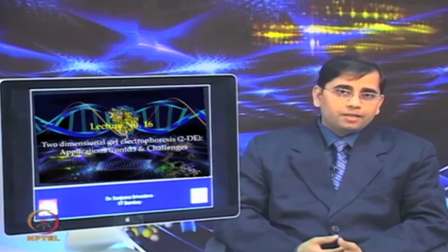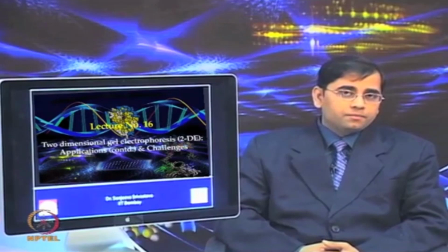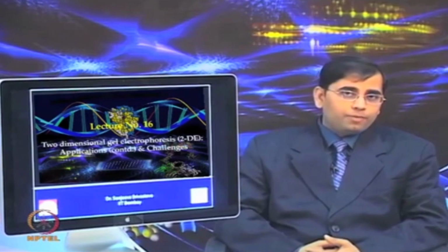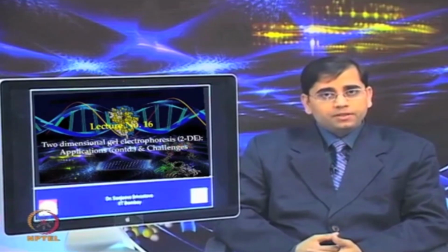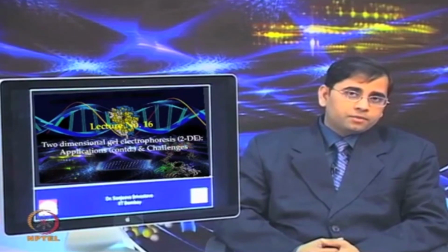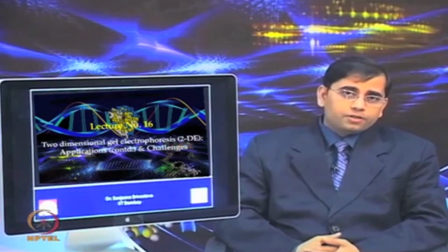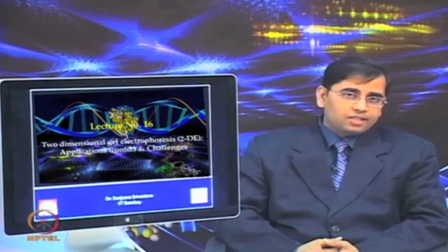We have gone through step by step, starting from the protein extraction, doing the quantification, isoelectric focusing, which separates proteins in their first dimension, followed by doing the equilibration, preparing the strips for second dimension separation, and then you separate the proteins on the SDS-PAGE based on the molecular weight, followed by staining the gels to visualize the spots, and then scan those images, analyze them by using various software, and then perform some statistical analysis to obtain some biological insight.